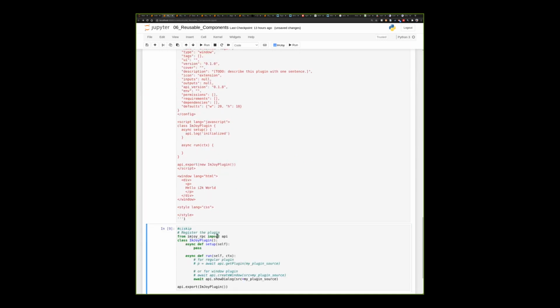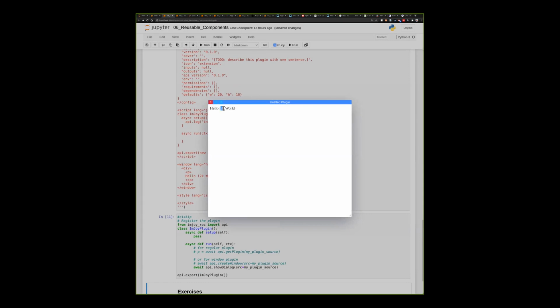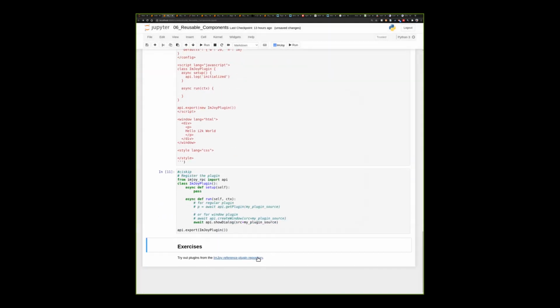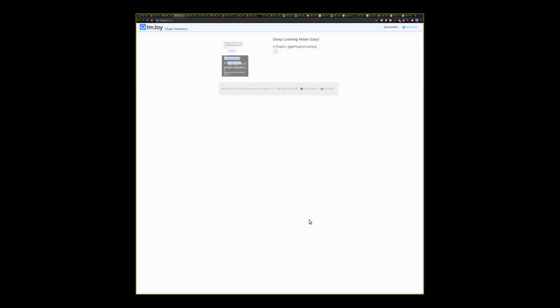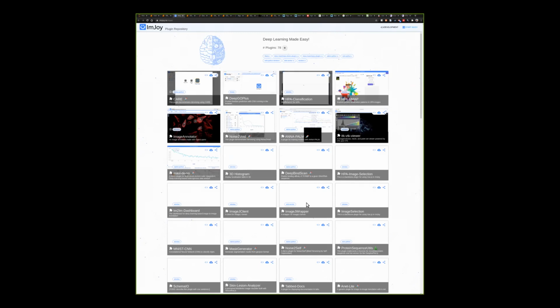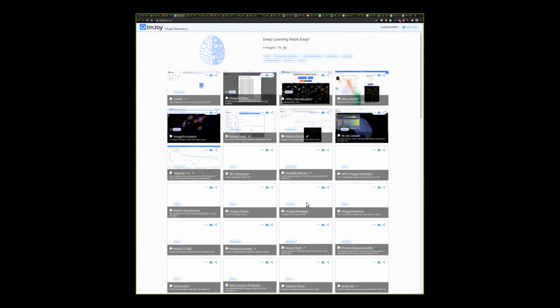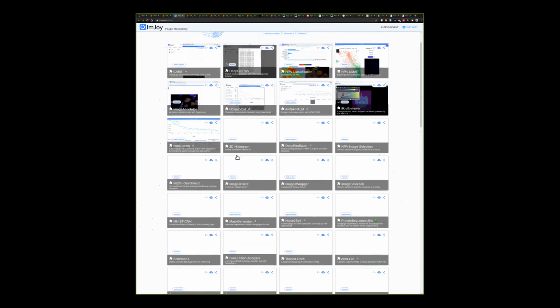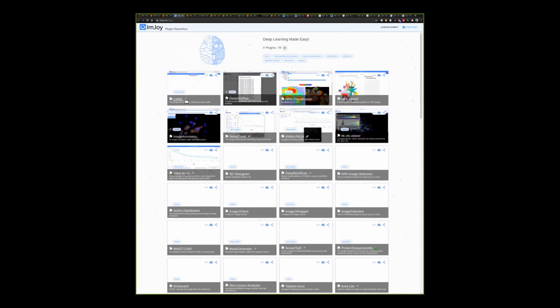Hello World, and then it changes the message. And this is just something to be aware of, but there are a lot of examples out there. It's great for reproducibility and to reuse some tools and to combine them together to do new, interesting things. There are all these examples that you can try.